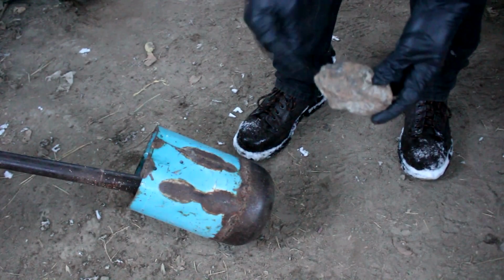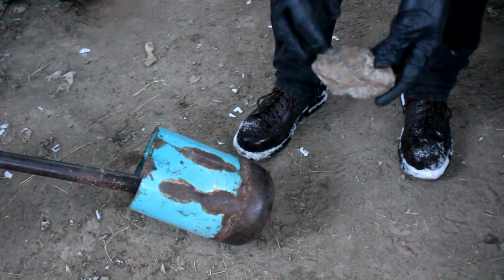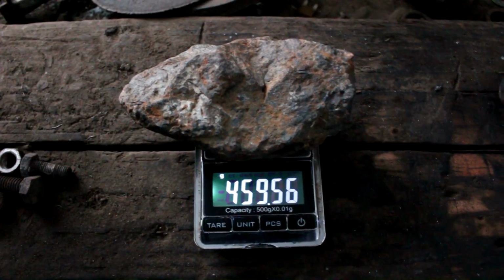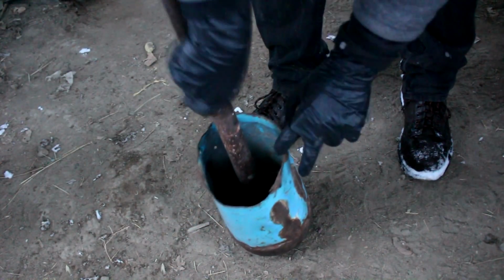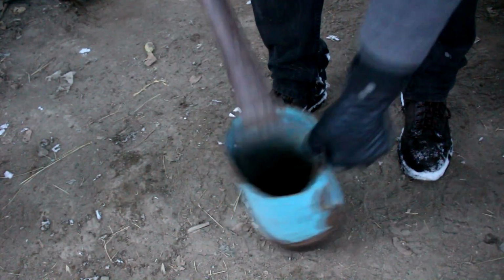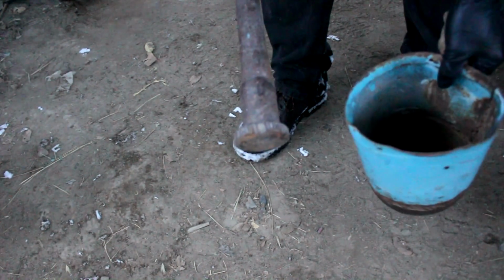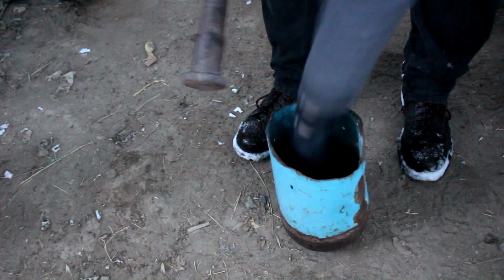So the first thing I need to do is grind this rock up into a fine powder to give it as much surface area as possible and expose the uranium. Since I'm just doing a small 460 gram sample, I'm going to be using my hand crusher here. This is basically a pestle and mortar, except I'm using an axle and a pipe cap as my pestle and mortar. So I'm just going to crush the rock up.